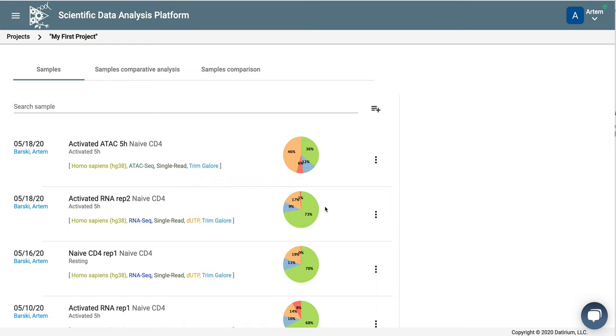Hello, this is Artem Barsky, co-founder of Datirium. In the previous video, we looked at how to start analysis of RNA-seq data. And today, we will look at the results.